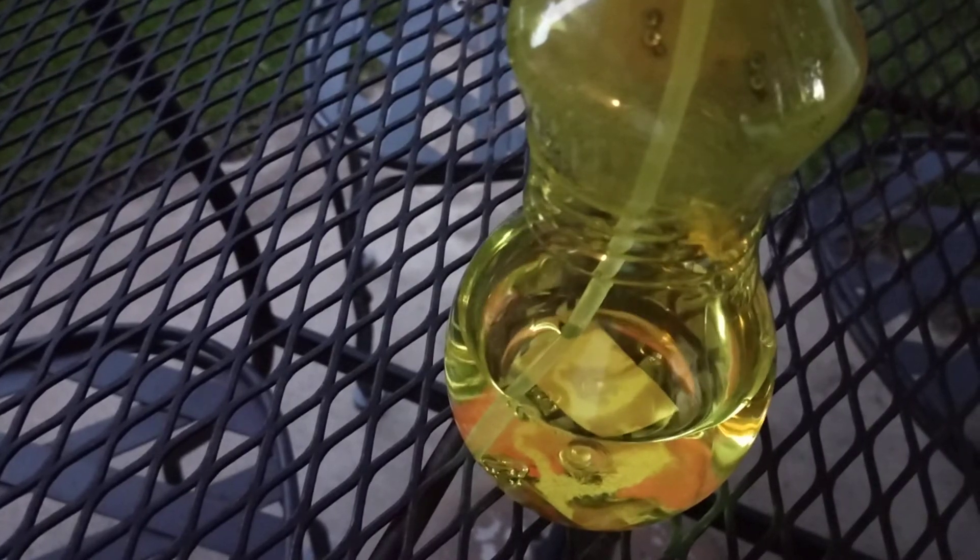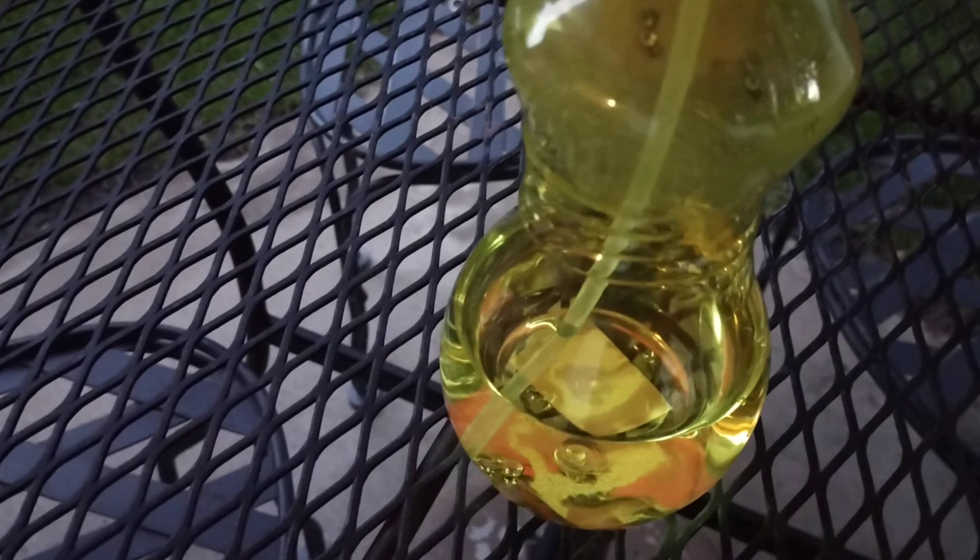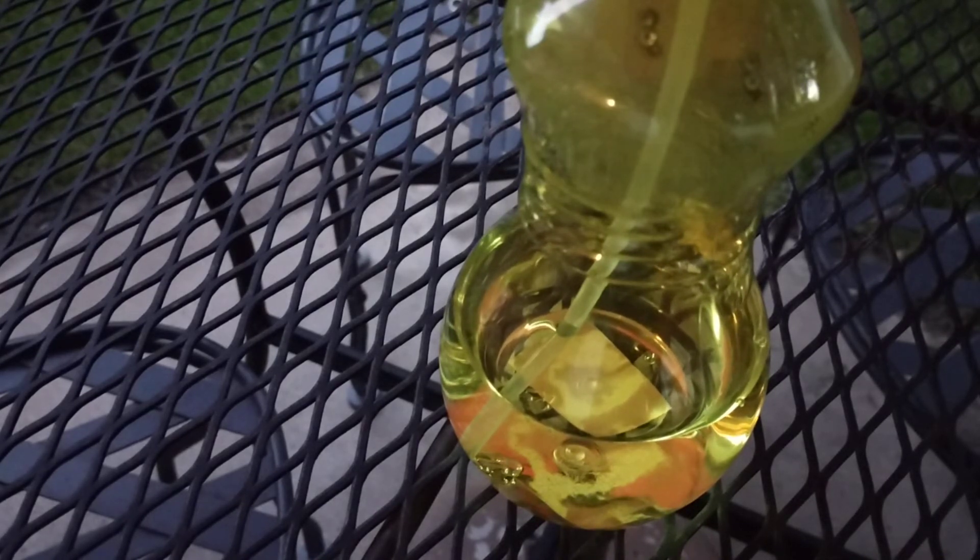Ok guys, another experiment. I got bleach in this bottle here. I'm going to add acetone to it and see what happens.